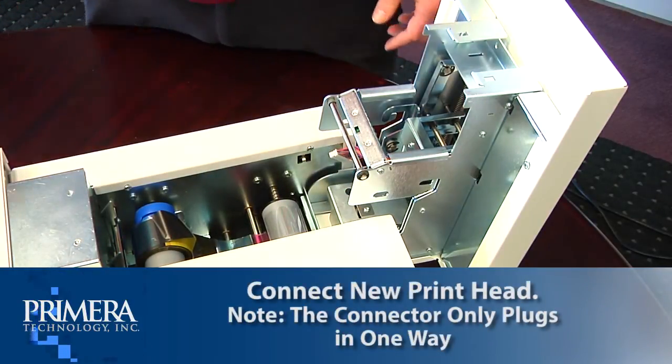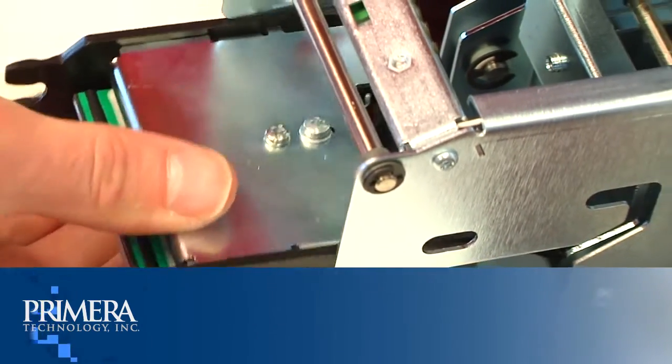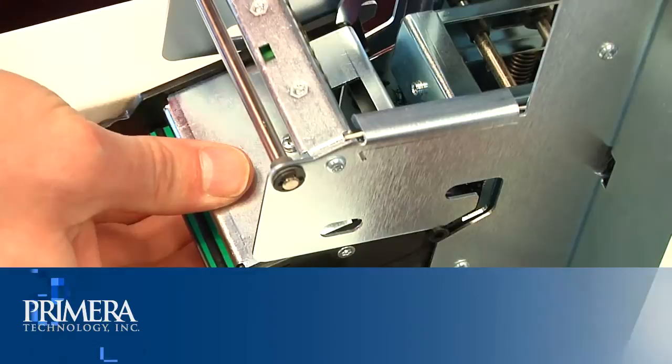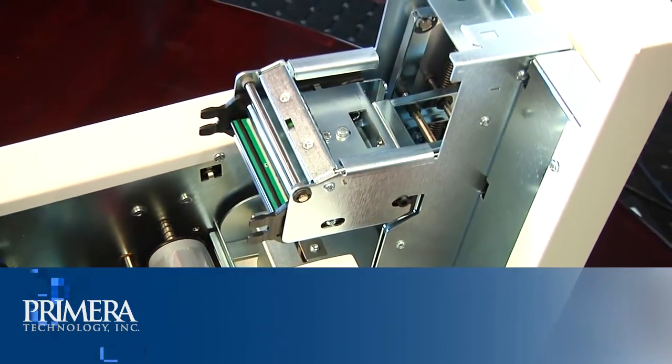Locate the new printhead and connect it. Note that the connector only plugs in easily one way — make sure you have it installed in the correct orientation. Rotate the printhead 180 degrees and push it back into the metal housing.